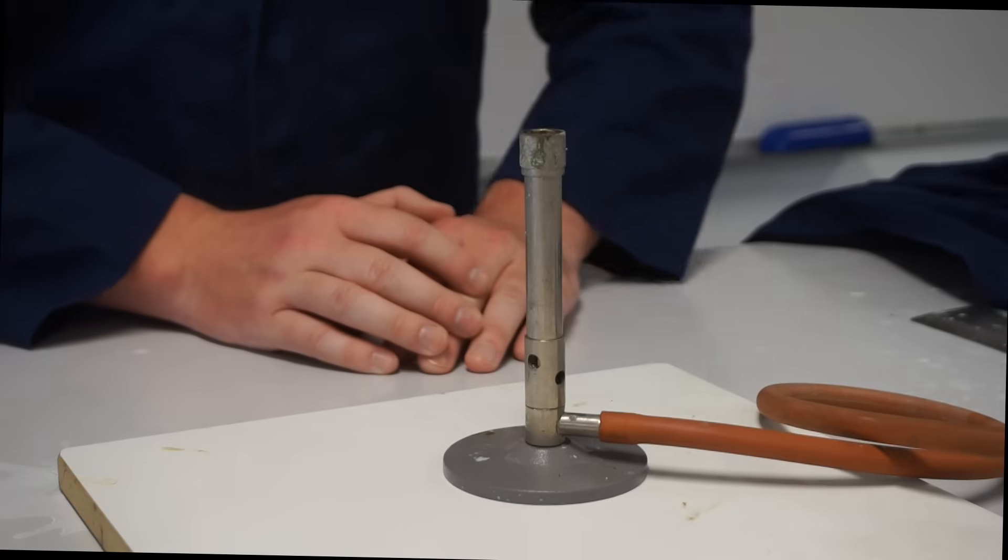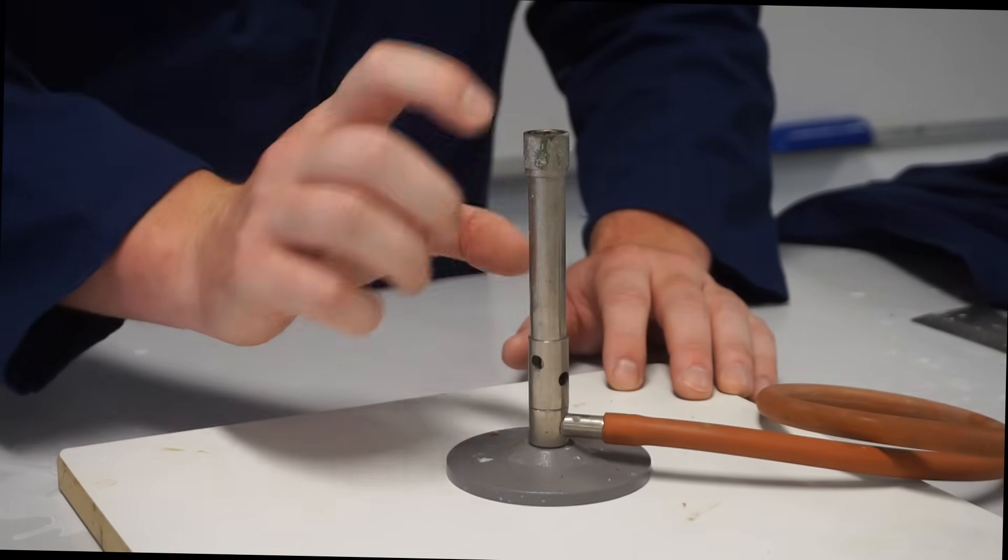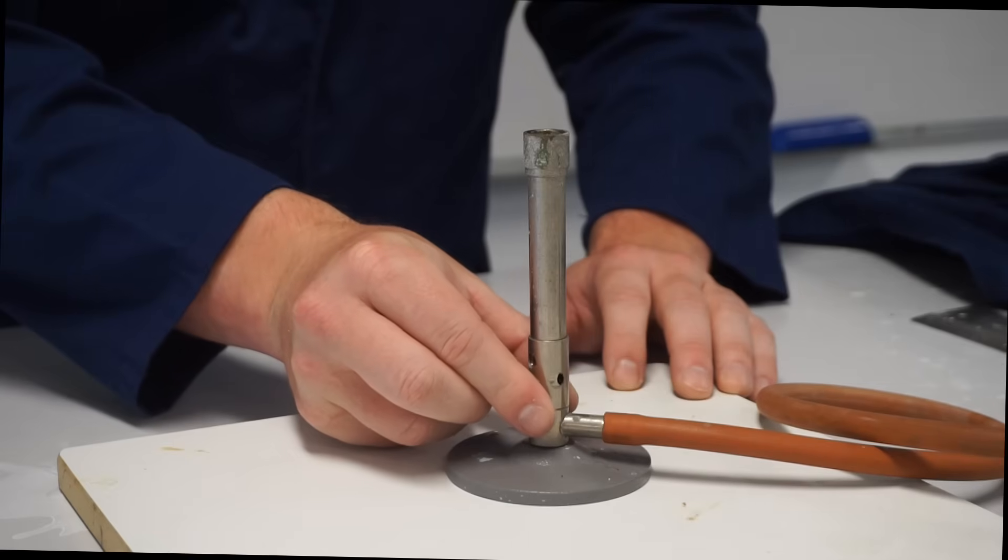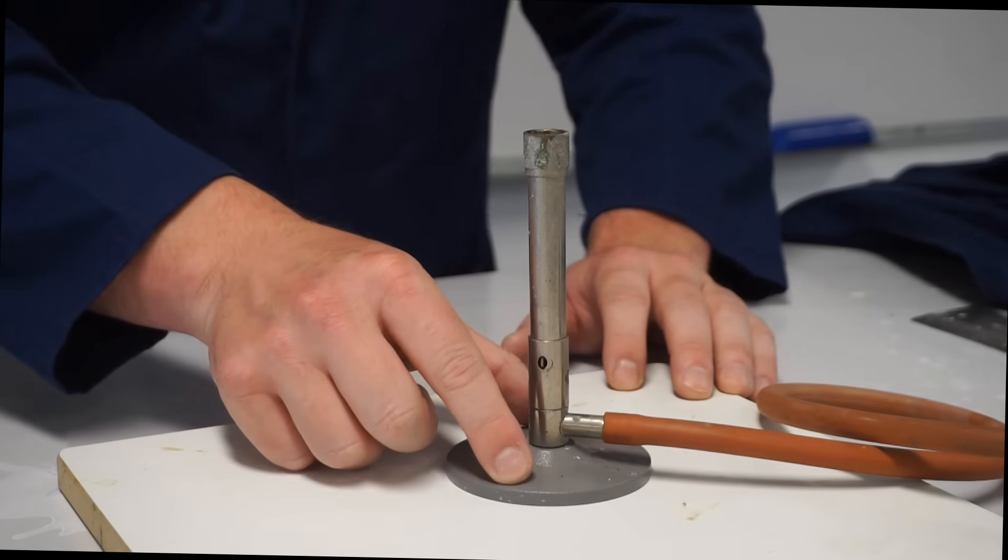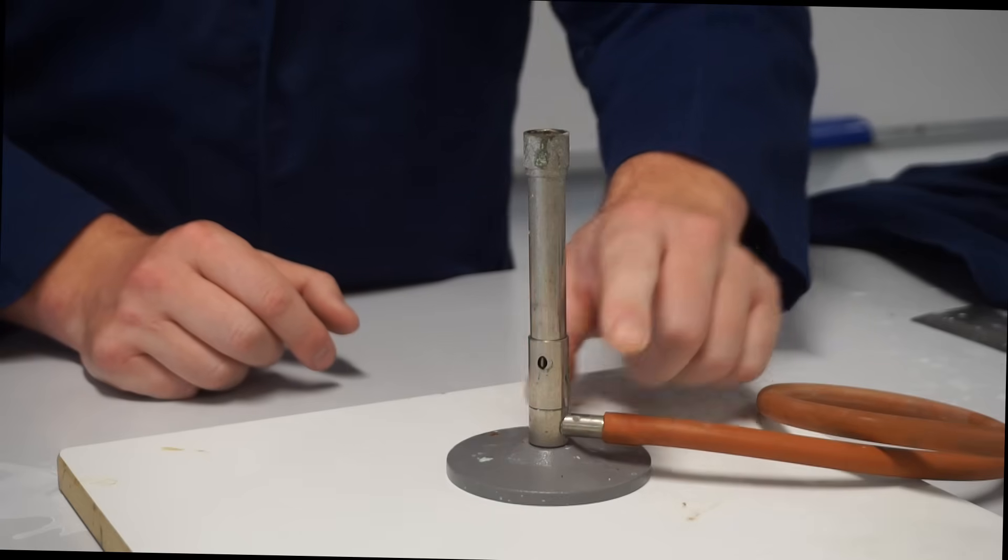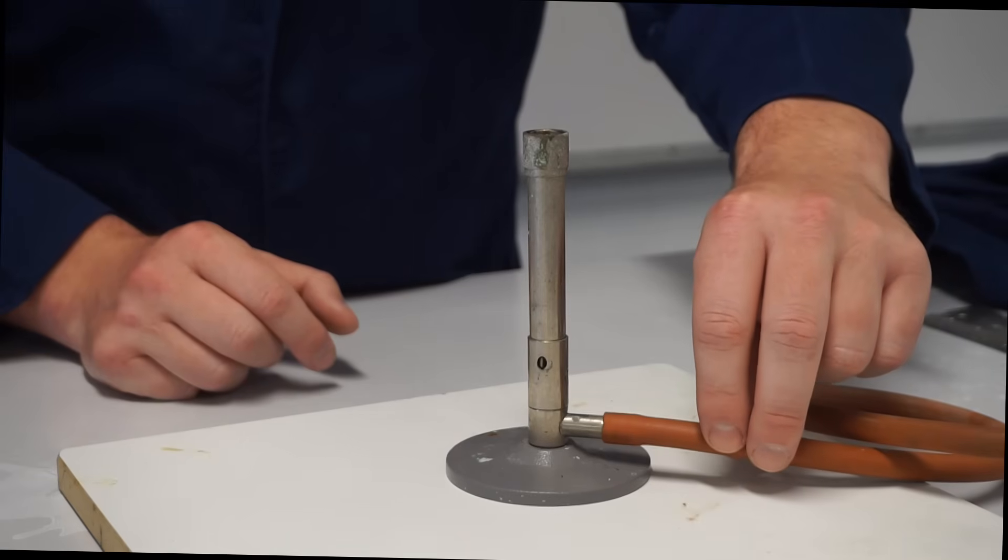Before we begin I just want to take you through some of the main parts of our Bunsen burner. We have the barrel, we have the collar which you can rotate to open and close a little air hole, we have the base, we have the gas inlet and we have the gas hose which is usually a rubber or silicon material.